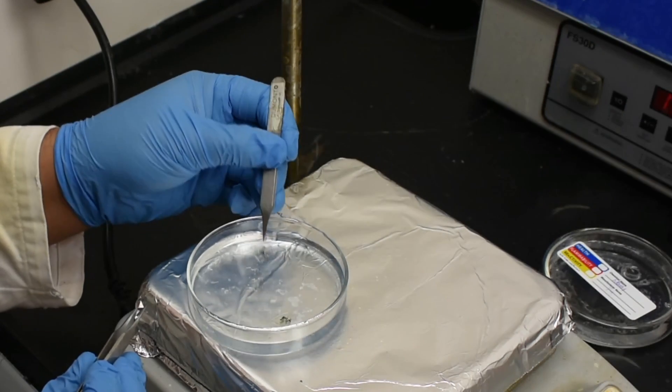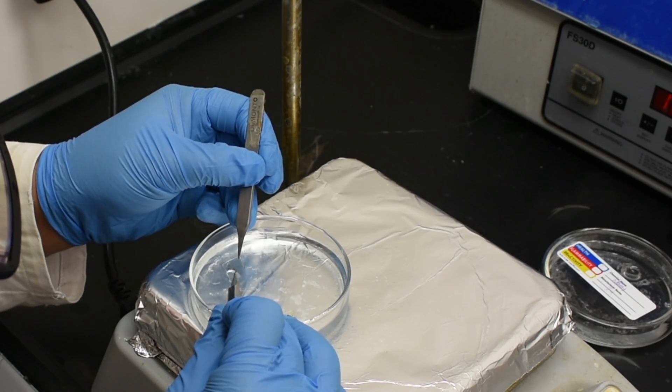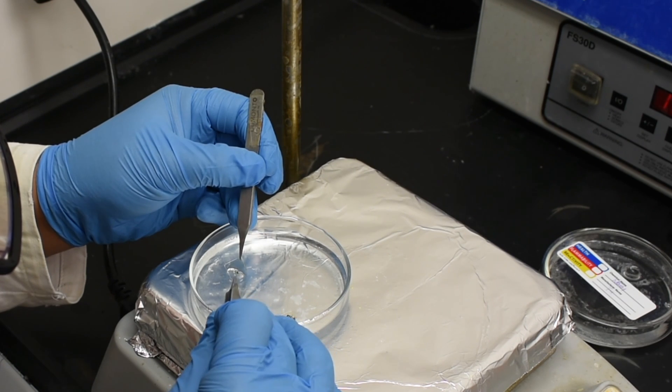Once signs of delamination begin, it is possible to use a second pair of tweezers to encourage the films to begin separating from the substrate.